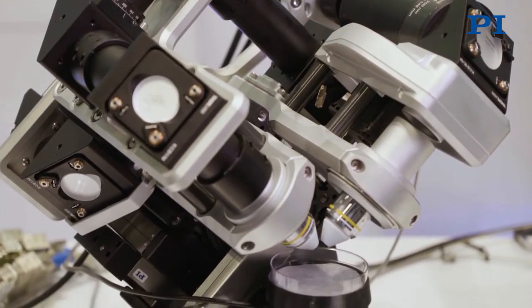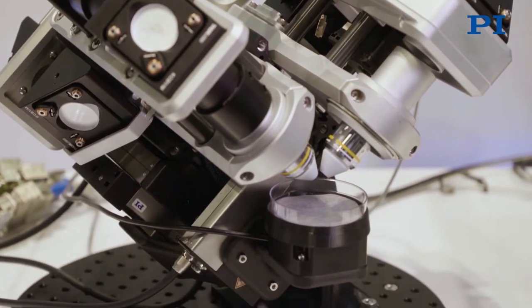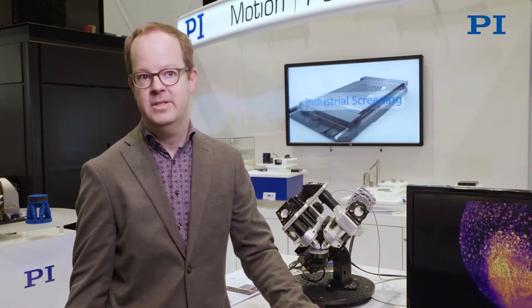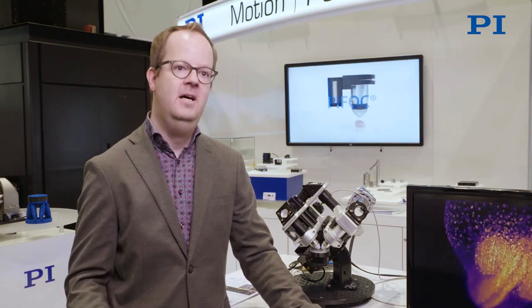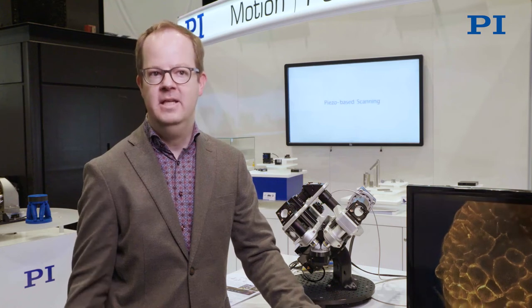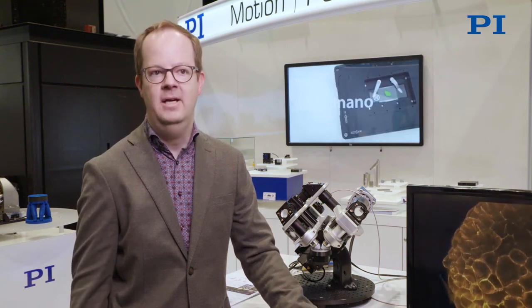The Flamingo project is our latest instrument that we're developing. The idea behind this is to share the technology with the biologists by bringing the microscope into their labs. So instead of the biologists traveling to us with their precious samples, we can take the hardware and bring it to their lab so they can run the experiments in their own lab.